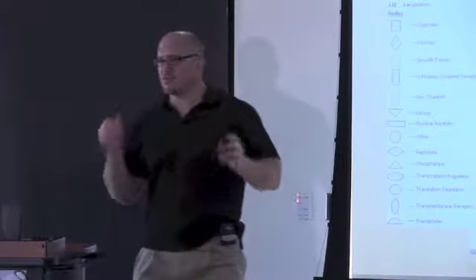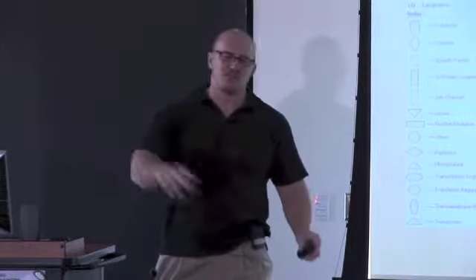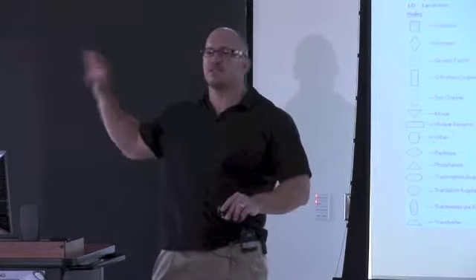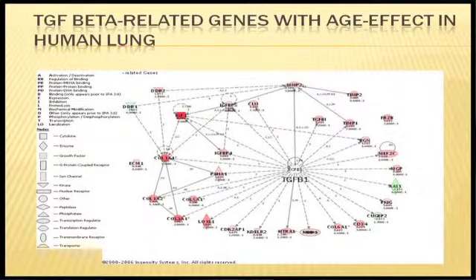I mean, if you think of it, you're studying a particular tissue, there's endocrine effects, there's growth factors coming in, blah, blah, blah. And that might be a tissue that's completely distal to what you're looking at. But we can see those effects if we actually pay attention to this footprint. And that's that connectivity, right? We've got a central molecule here connecting all this gene expression. I mean, this is what you want, right?